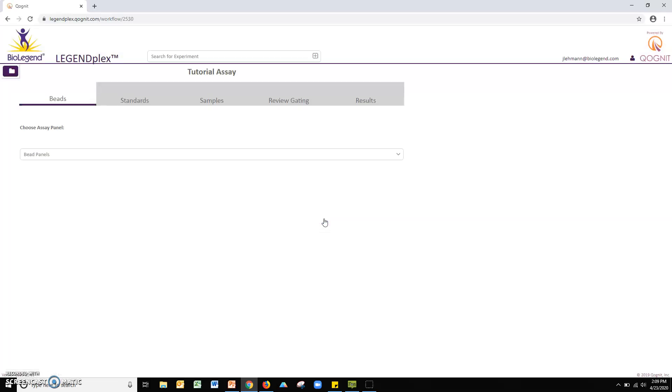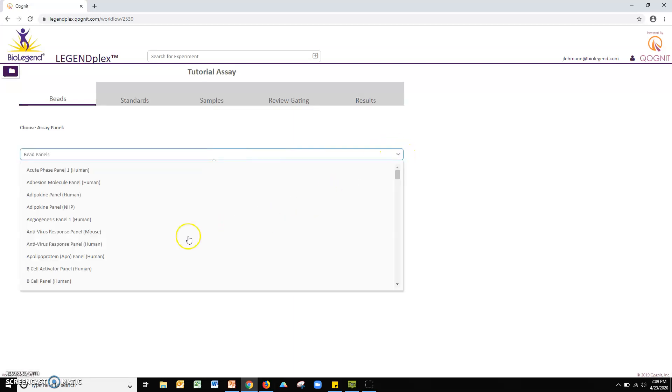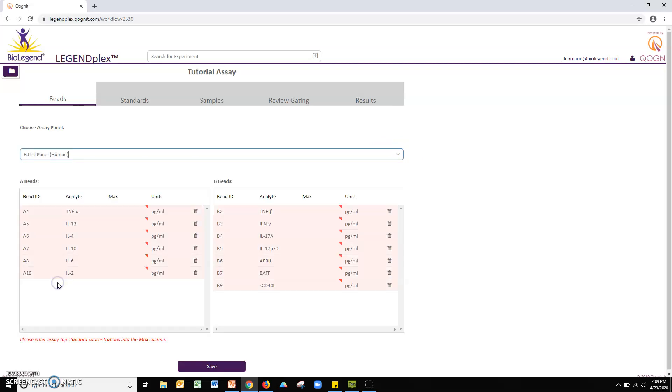Next, find your particular LegendPlex assay from the beads pull-down menu. This will then populate all the bead ID fields associated with the assay. For mix and match assays, please click the trash can icon to remove any unnecessary targets.